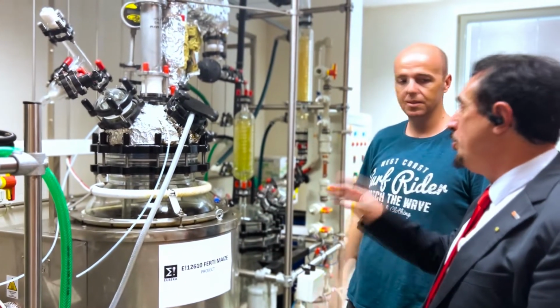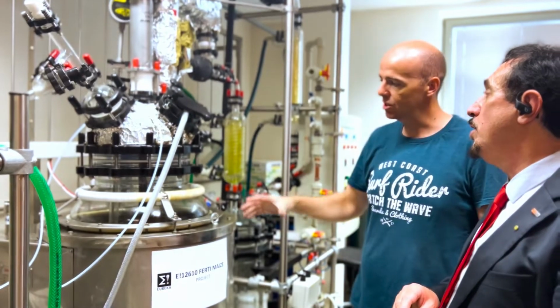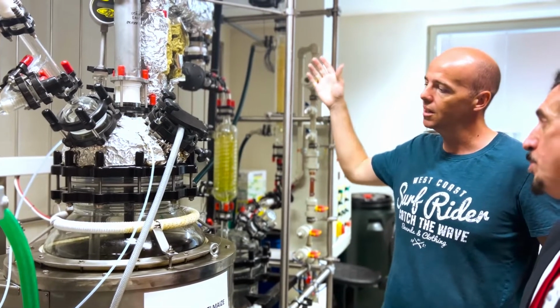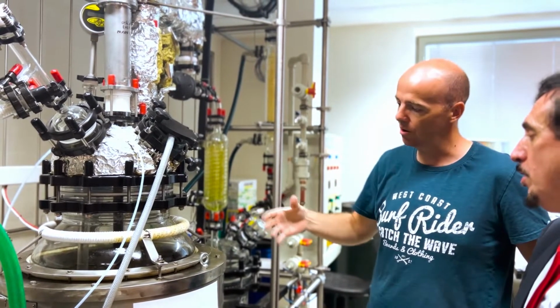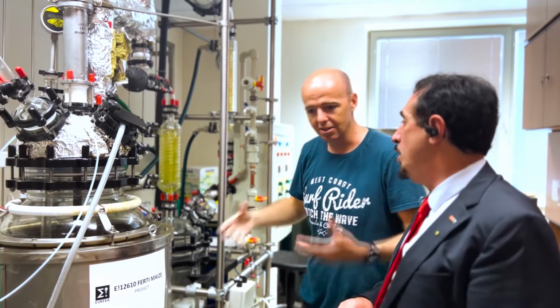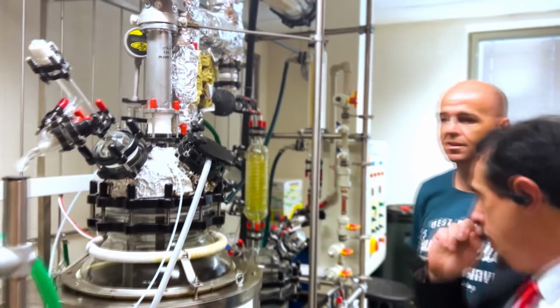The capacity. The input of the reactor is what? It's the waste water, as mentioned. Same percentage, same conditions, however, huge amount. Also it's connected with the vacuum evaporator. So if it's necessary to concentrate or thicken the sample, we can. Basically we need to evaporate the water from the product and make it more concentrated, to concentrate the protein, the nutrients for the plants, in the fertilizer. So basically, it's an evaporation process.